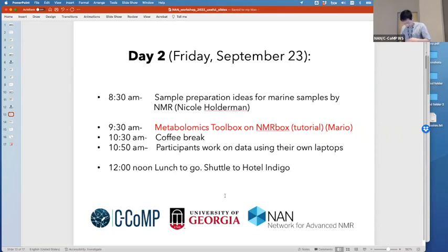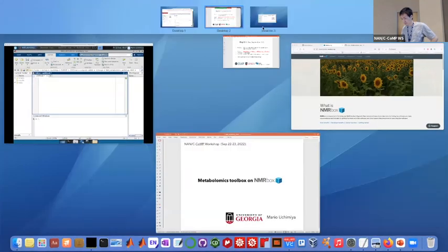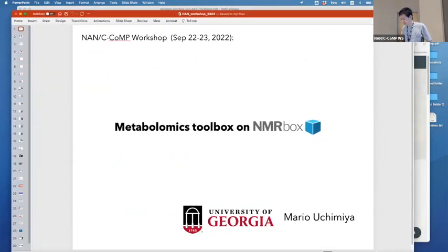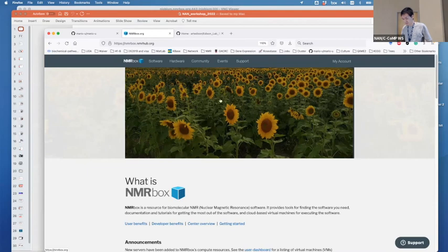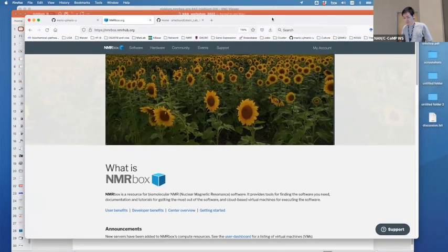Okay, without further ado, we're going to make a transition to this next step. Mario Uchimiya is going to be leading all of you in an interactive hands-on tutorial using NMRbox. So this is where we're going to start to switch. He's first going to tell you about what you're going to do interactively on your own after the coffee break. He's going to show you the steps.